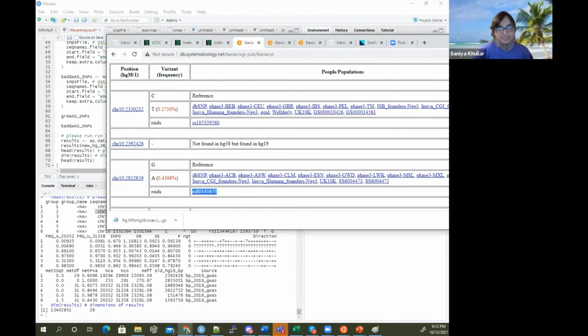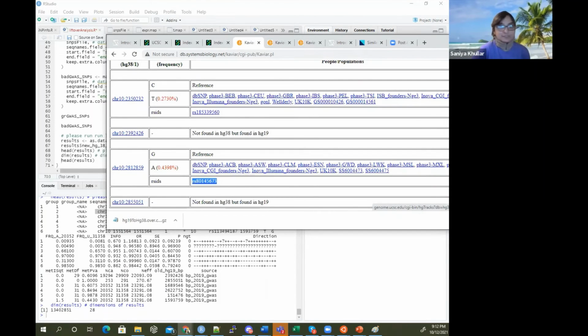We said that the corresponding position, it could not find. So let me show this other example too. This position here was the old one for the second row. So guys, just remember that we're looking in the second row here. When you're looking in our output, this is first, second, third, fourth, fifth, sixth rows.